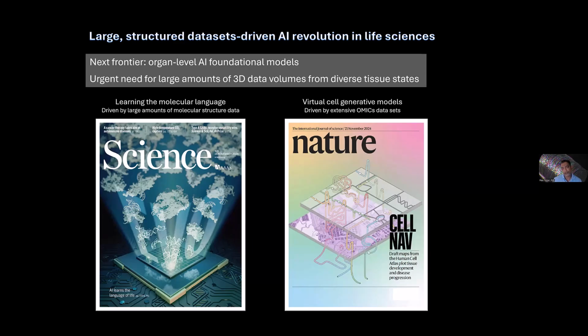So we're going to help that process by developing tools that are scalable, that can be used widely, and software ecosystems that can be used to standardize these data so that they can all be pooled in to eventually train these deep neural networks.